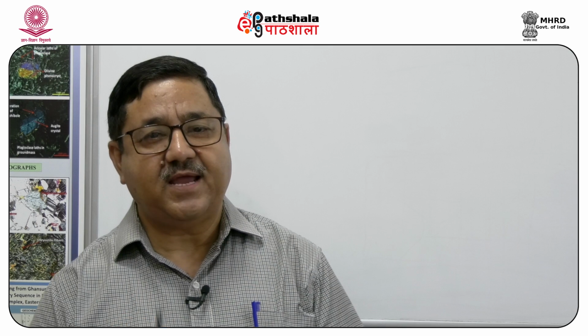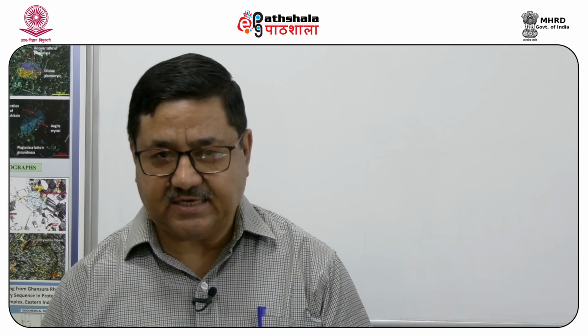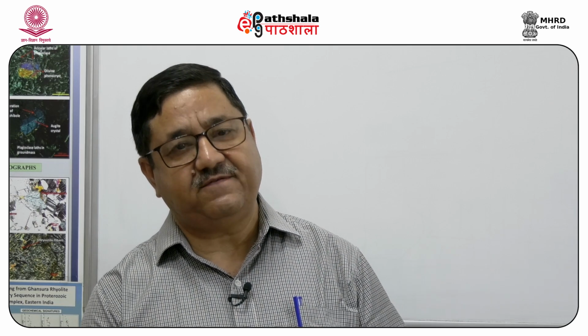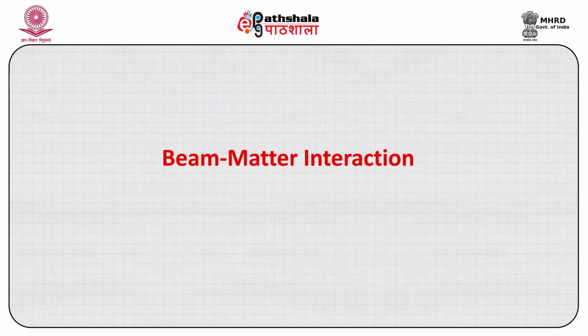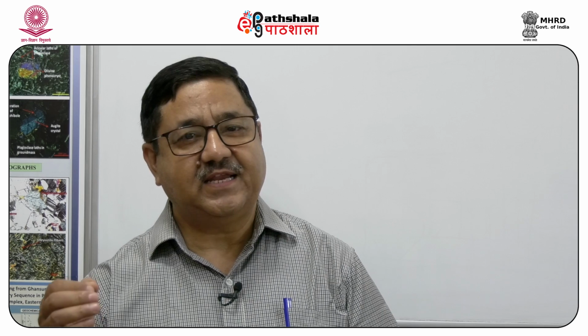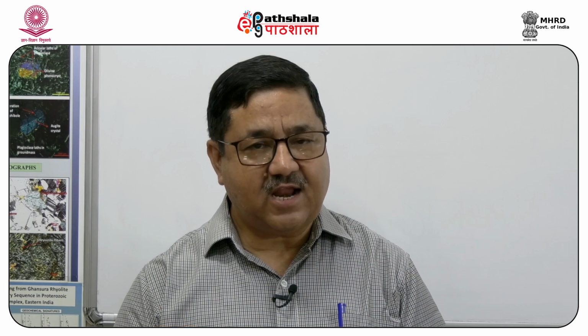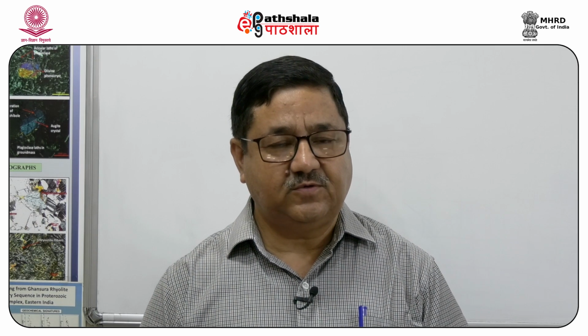What is actually meant by a scanning electron microscope is that you are doing a real time scanning, which means normally that you have a CRT or a cathode ray tube attached, where you are rastering an electron beam over the object of examination, and real time you are seeing the effect of the electron beam on the matter. So, we come from this to what happens when an electron beam interacts with matter, because that is what is allowing us to have a look or peep into the material which we are seeing.